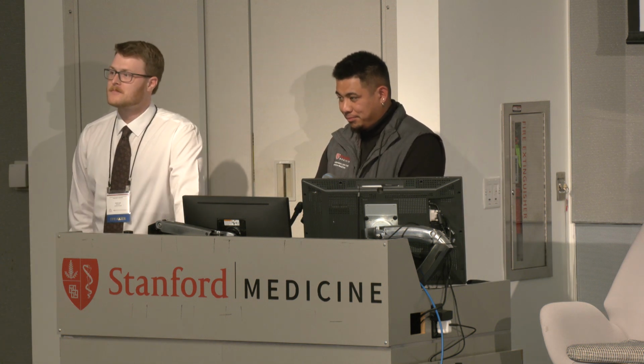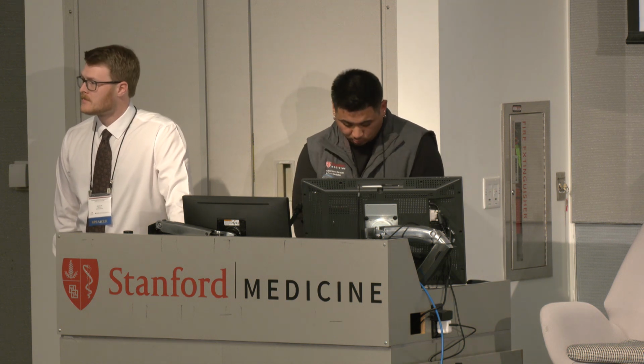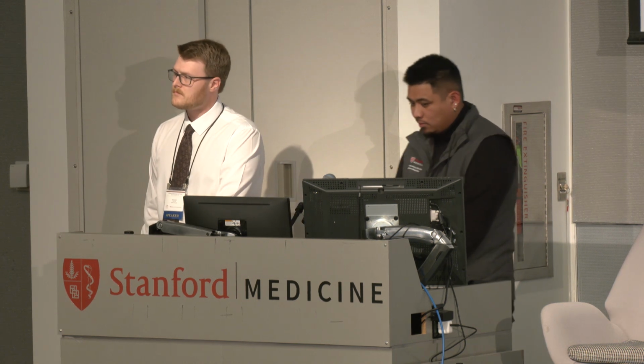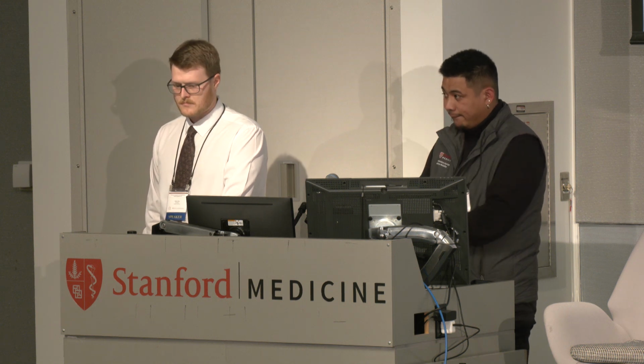So let's start with a couple of online questions. I think this question is originally from Nick, but anyone can chime in. I know we spent lots of the focus on the alpha beta depletion, the log depletions, but here is a question about CD19, CD20 depletion.